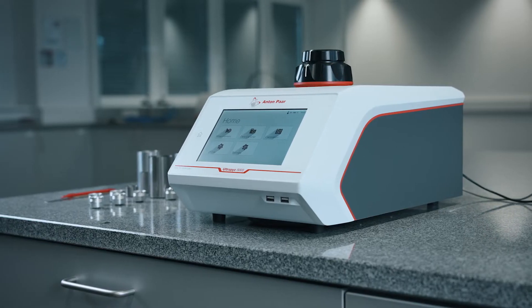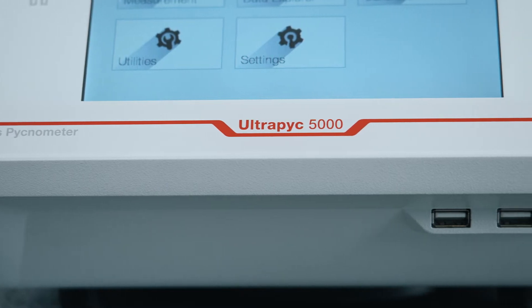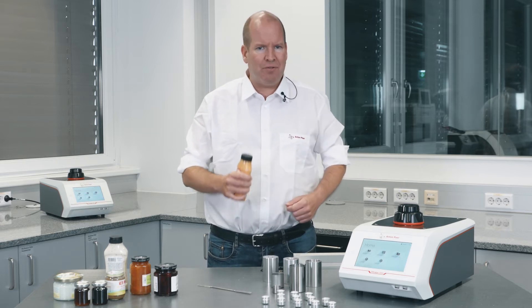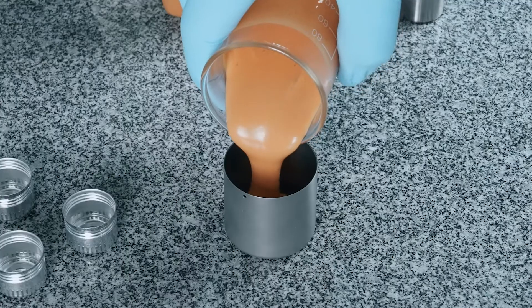Knowing the density conversion factor between volume and mass allows operators to determine how much actually goes into a package and how consistent the recipe is. Anton Paar's Ultrapyc 5000 measures the density of pasty, lumpy, sticky, and chunky foods, analyzing all kinds of semi-solid materials and viscous samples with ease. Scoop it out from the jar or squeeze it out of the tube — transferring or loading the sample with the wide measuring cups is straightforward.